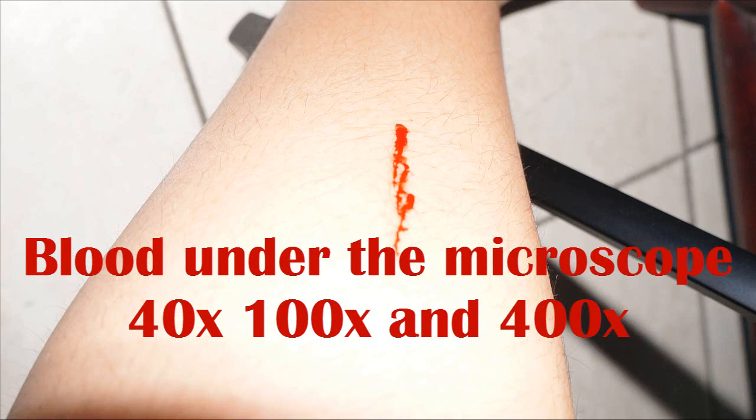Hello guys and welcome to another microscope video. Today I'm going to be showing you blood under a microscope.